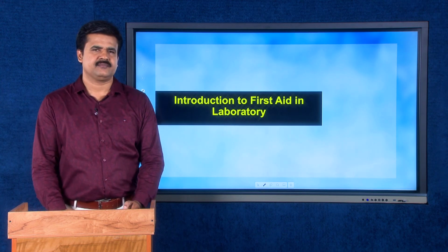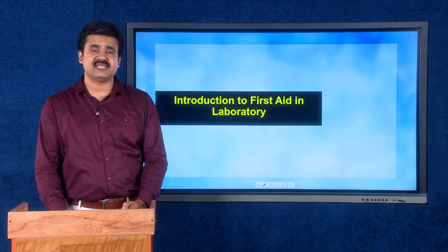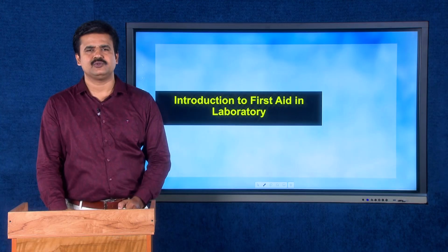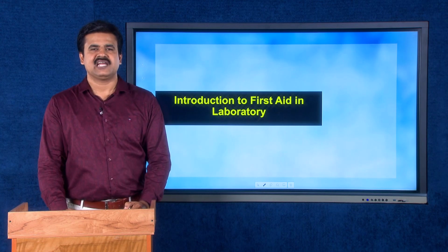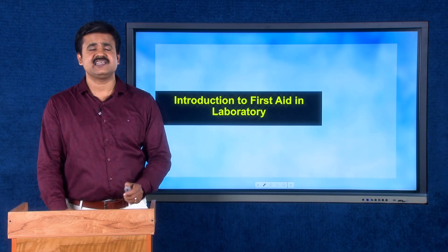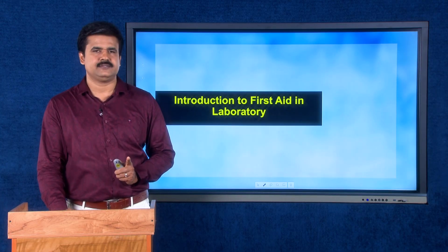In a laboratory, it may be a science laboratory or a chemical laboratory or a chemistry laboratory, we are handling enormous chemicals, glasswares and instruments. In certain cases of emergency, we have to adopt first aid. This first aid helps to protect the victim from further dangers. That is, first aid is of prime importance as far as laboratory working is considered.